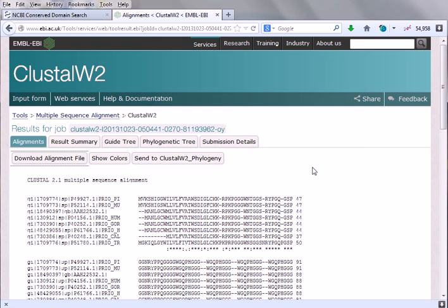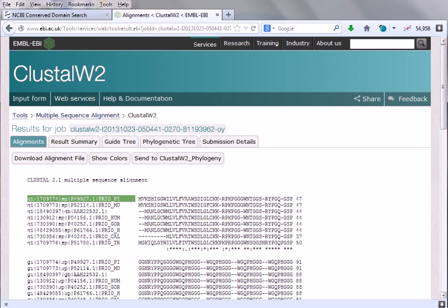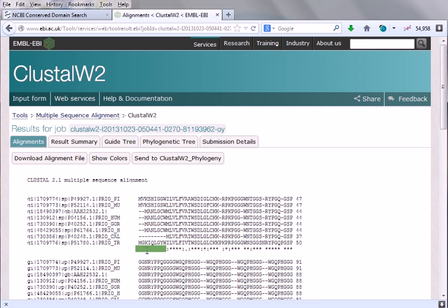I have also discussed when I told you about the theory part that in MSA, in multiple sequence alignment, we want more and more sequences. If you are adding more sequences, we'll be very much clear about our process and we will be very much confident about our result. That's why you need to take as many sequences as we can. You can see at this particular first few lines there are some mismatches and gaps. That's why they are not giving you anything in this part, they are giving you a blank. At this region, this is varying.